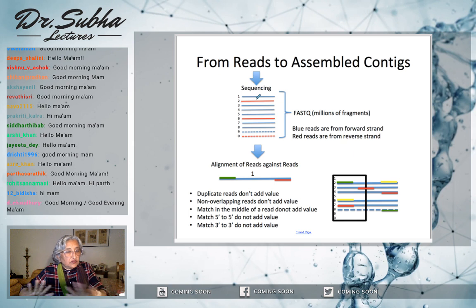But right now we're going to go simple alignment. The first read, I'll make it a little enlarged now. I'm looking at the green sequence. I color coded a stretch of sequence green and another stretch red. Now I'm going to look in the rest of the blue reads, because I dropped the red reads for convenience right now. In every read I found the 5' end and the 3' end.